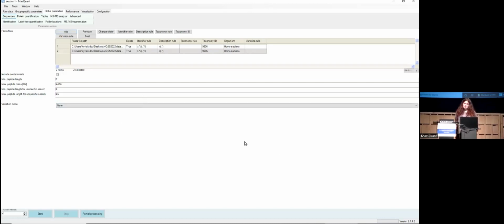And just as a basic example, if you have a server that has 200 GB of memory, you will put no more than 100 here, if you process this one. But if you process DIA, it's 50. You have to select 50 or less, but no more than 50. Here it's just an example, we do not change it, but just be sure about this one because it's extremely important when you process a data set in MaxQuant.